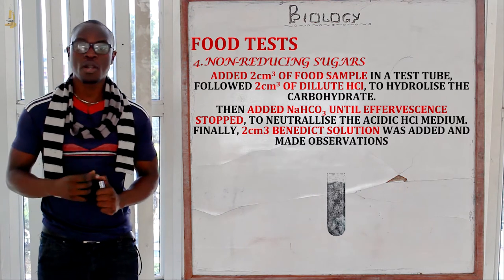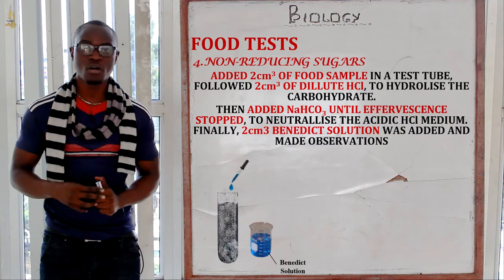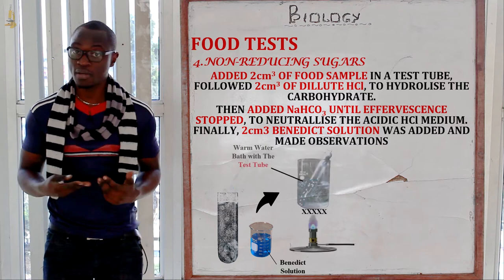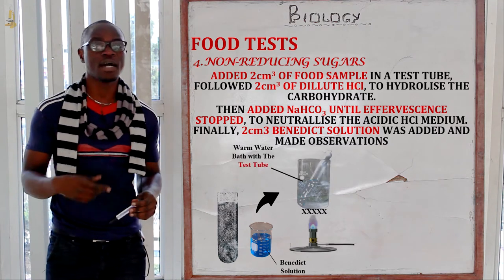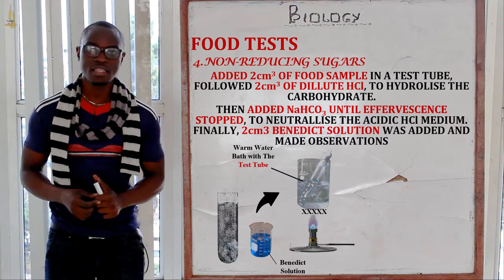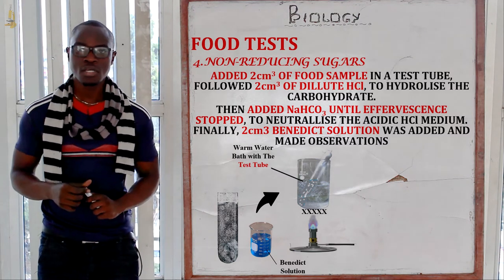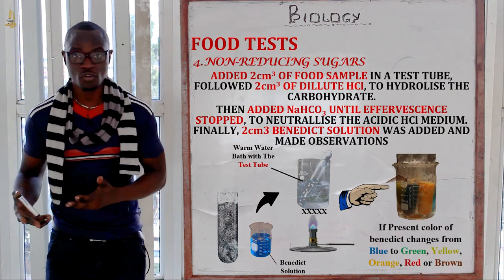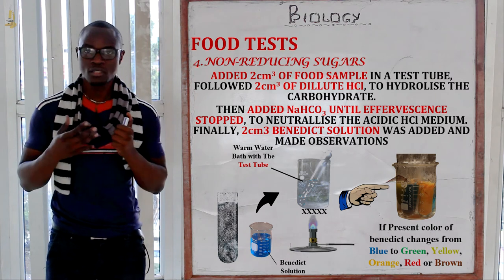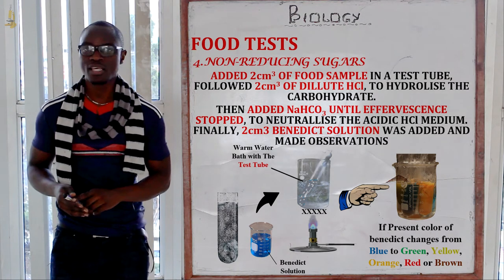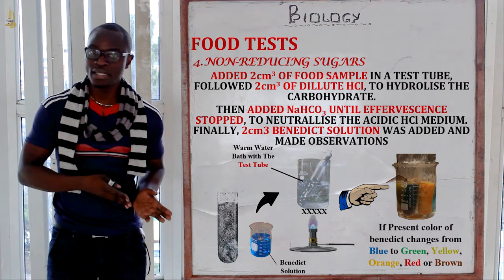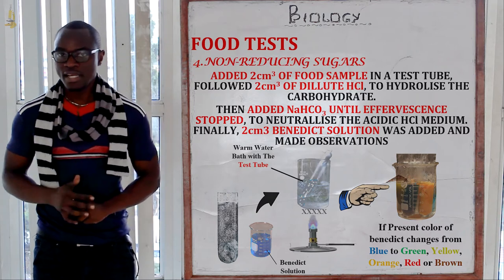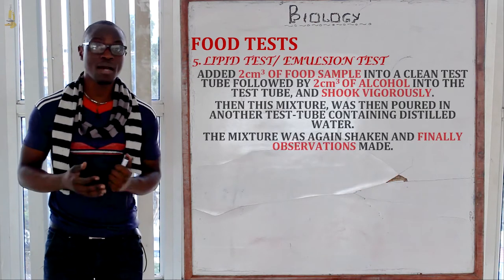After the fizzing has stopped, we add about two centimetres cubed of Benedict's solution. Then we take the test tube and place it again inside the warm water bath to accelerate the chemical reaction. If non-reducing sugar is present, the colour of the Benedict's solution will change from blue to either green, orange, red, or brown — brown indicating a higher amount and green indicating a very low amount.